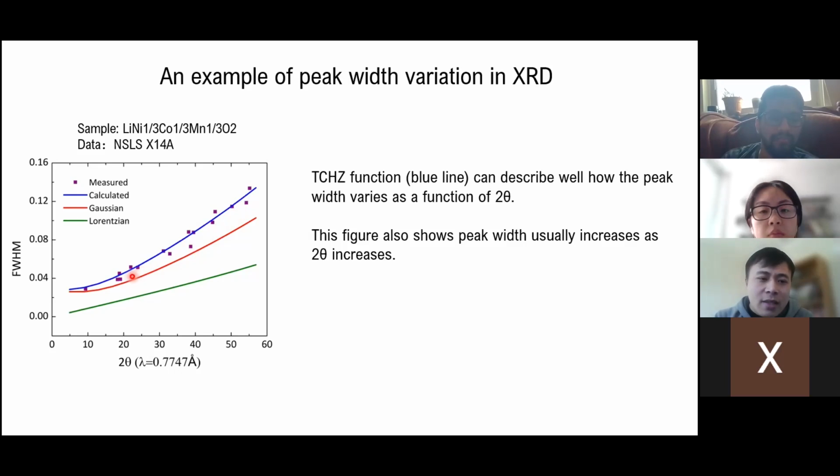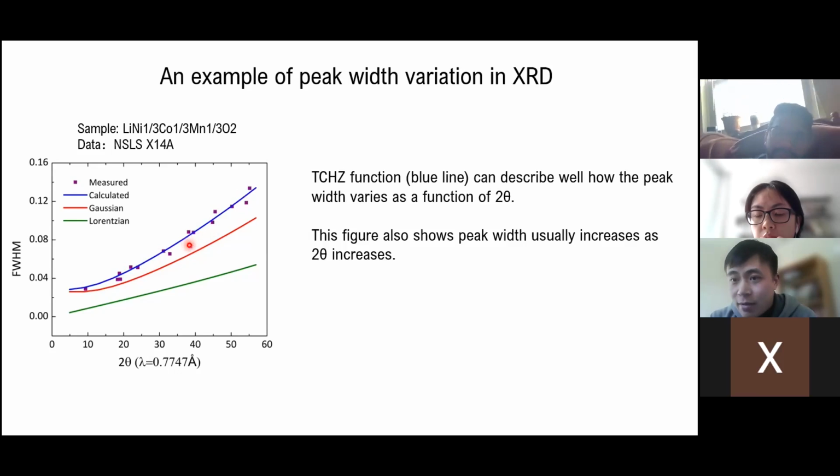And in fact, if it is a very perfect sample, let's say a single crystal, which has no defects, grain boundaries or whatsoever, we will see a very clear trend that doesn't really have this kind of scattered behavior. And this kind of scattered behavior is already indicating that our sample is not so perfect, right? But who has the perfect sample?